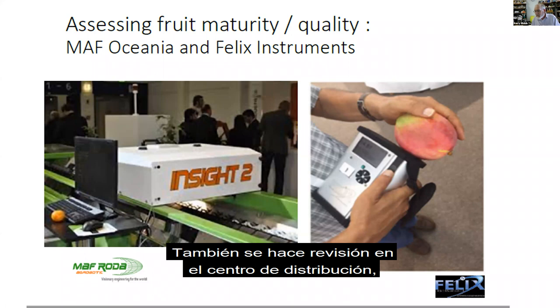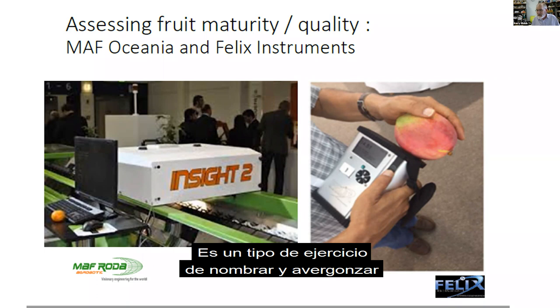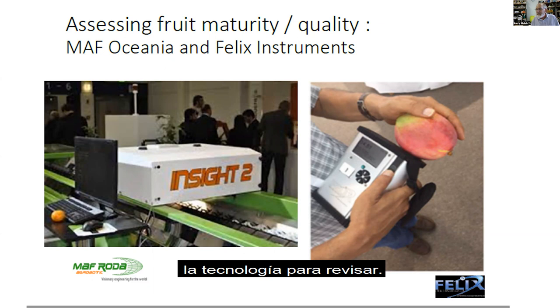There is also checking done at the distribution centre. So the F750, F751 can be used in the distribution centre to check. And the Australian Mango Industry Association actually publishes that information. So by grower name and consignment, the result is published in a newsletter. It is a kind of name and shame exercise to encourage people to up their game in terms of the dry matter content. And then finally, the retailers will also utilize the technology to check.